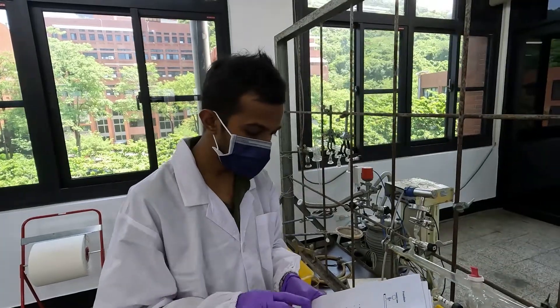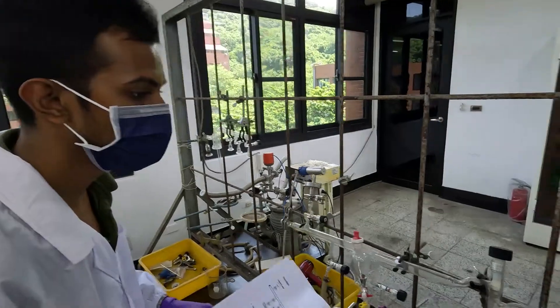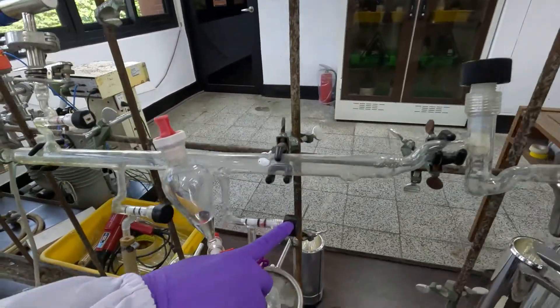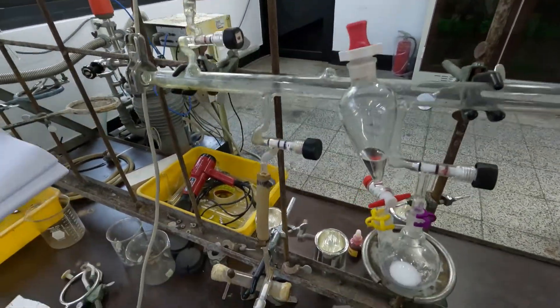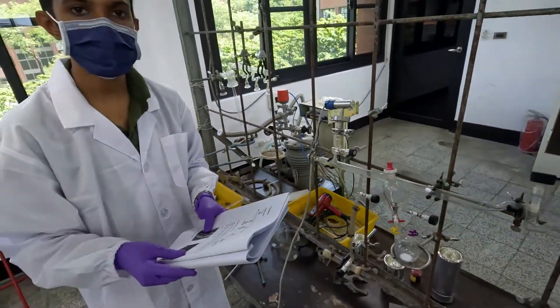The next step is to close the A, B, C, D, and E valves. I can show you these valves in the setup. This is valve A, valve B, valve C, valve D, and valve E. You can see these labels in your experimental handbook.